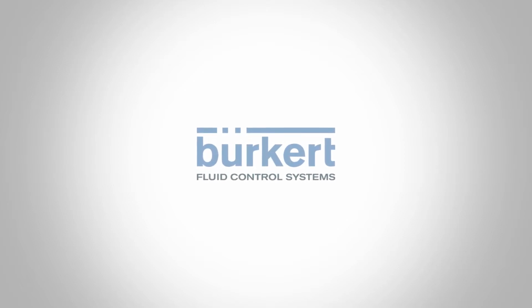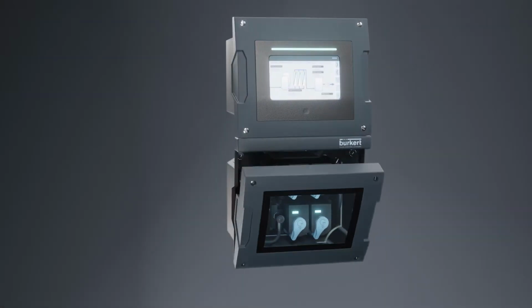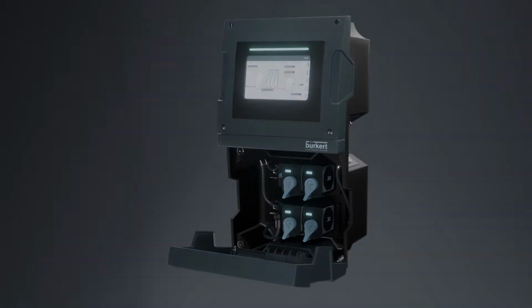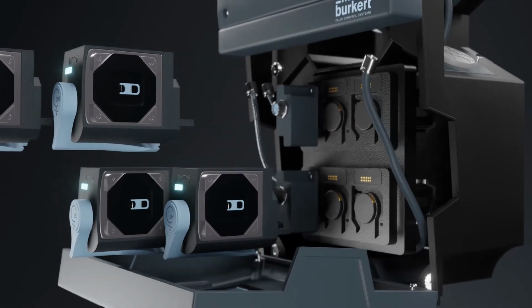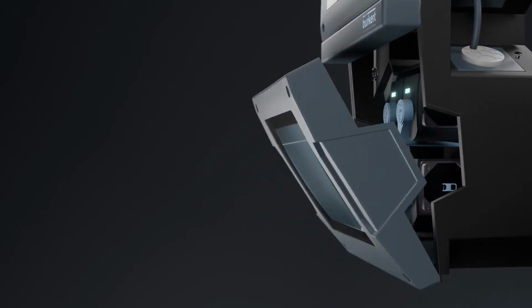Burkert's Type 8905 online analysis system for drinking water offers complete flexibility when it comes to the analysis of a wide range of parameters pertinent to drinking water treatment. Ever since its launch more than 5 years ago, the Type 8905 has evolved year on year to accommodate and factor in an ever-expanding number of functions. Let's take a look at some of the key features of the product.